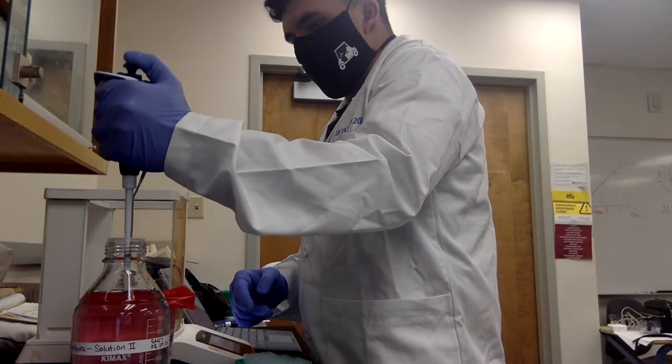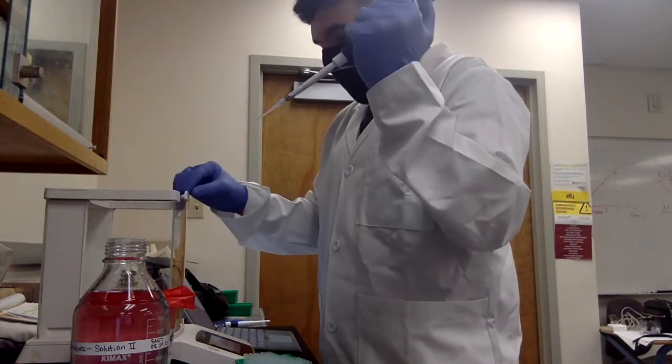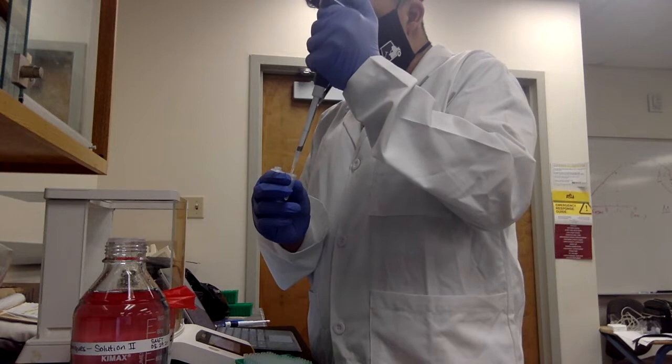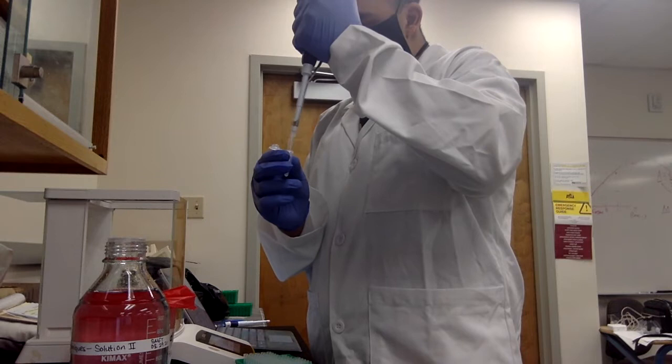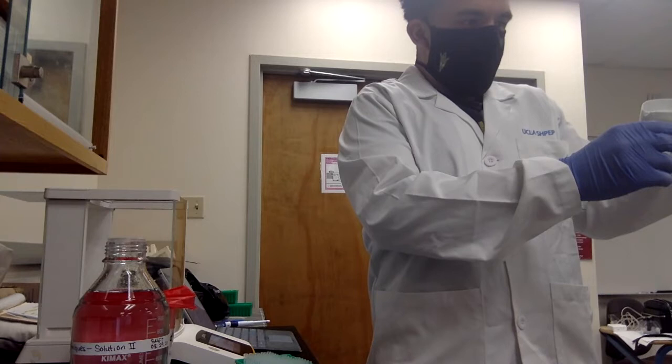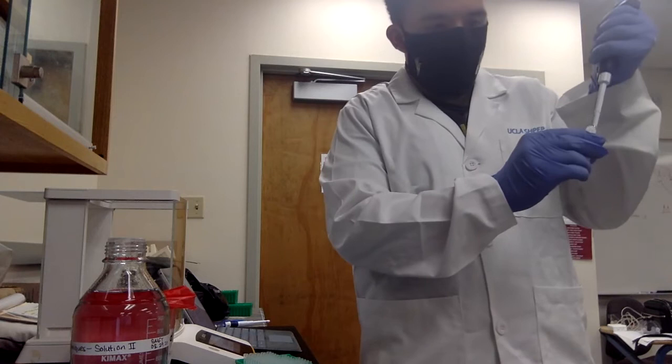So if you see some liquid left in the tube, you just eject the tube and use a new one. Okay, just to let you know. Yeah. Thank you. Is this liquid or an air bubble? I'm not sure. If you're not sure, just redo this. This shouldn't take so long.